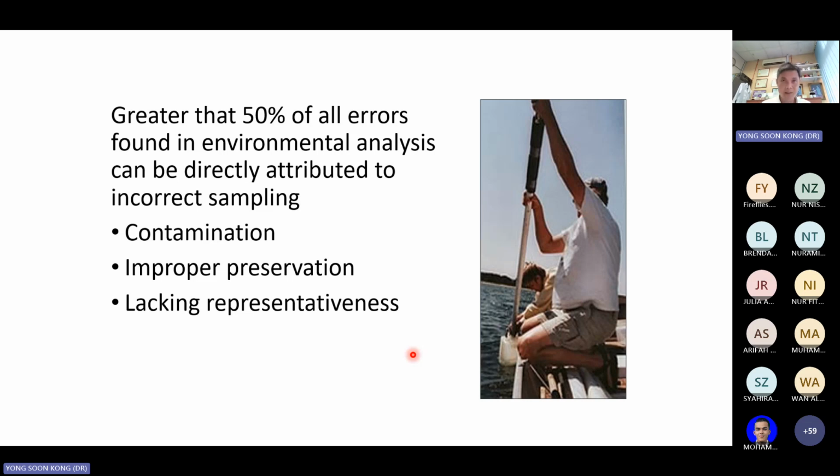Well, it's as easy as what you saw just now in maximum holding time. I already told you that these analytes, some of them, are not stable. They're subject to changes. Now, if these changes are so big, how do you trust that your data are accurate or precise? So it's mostly because of the accuracy and the precision of the data that we are so particular that we have to make sure that our data is trustworthy and reliable.